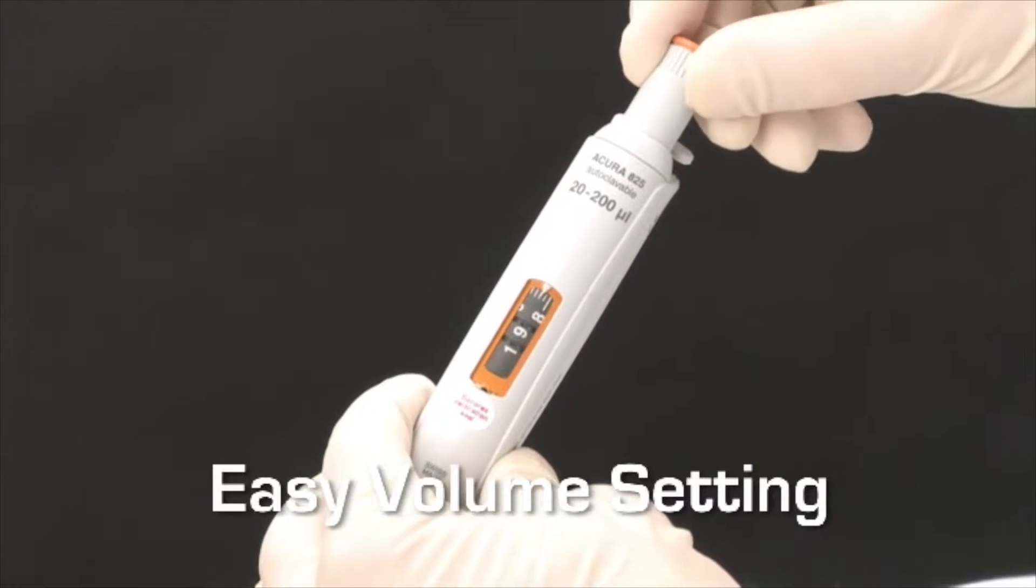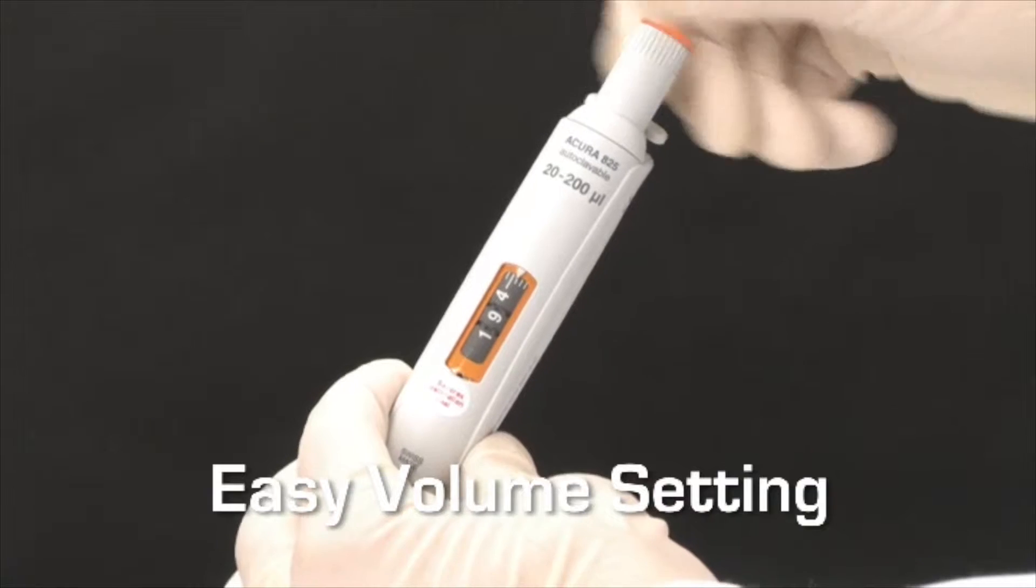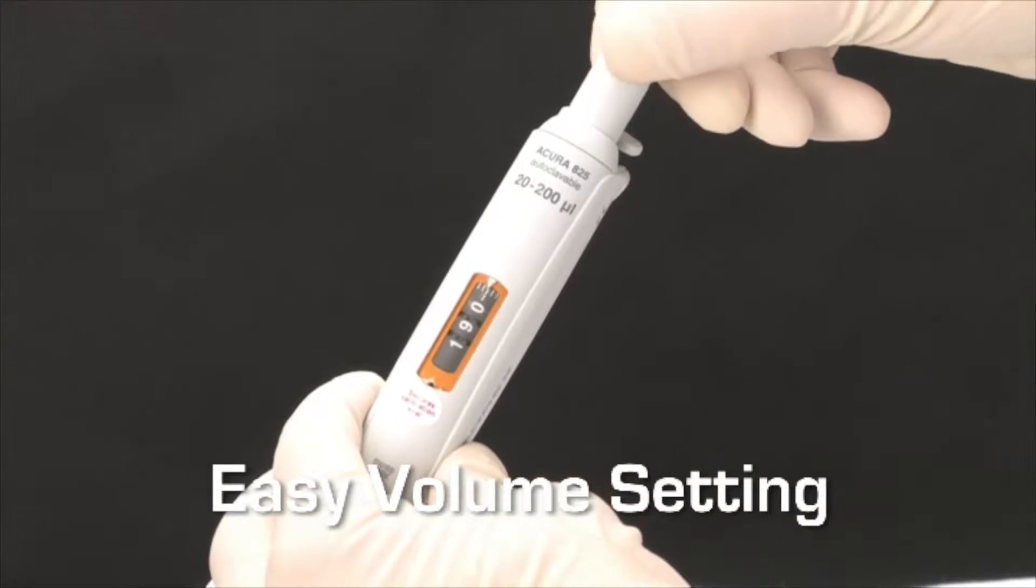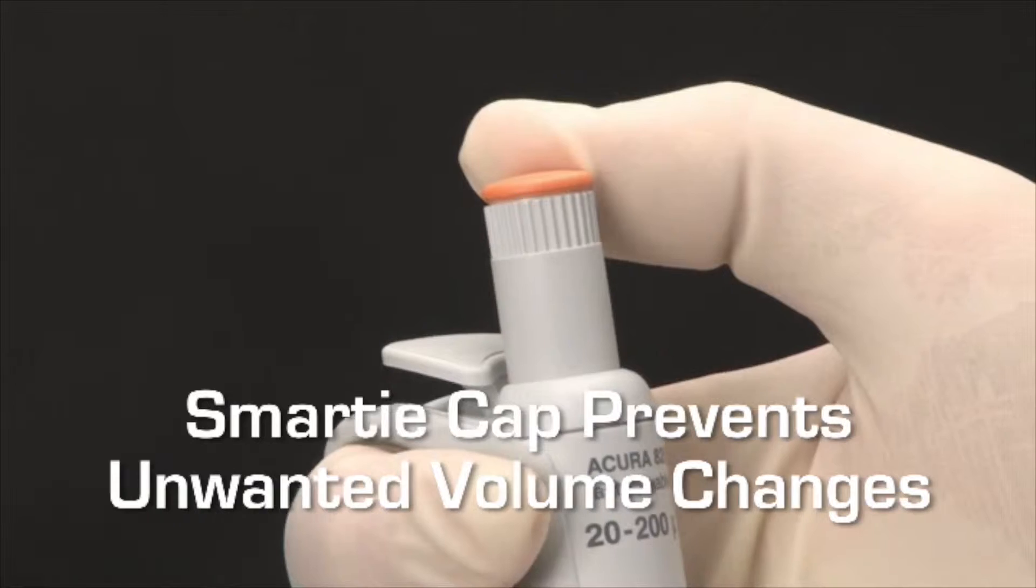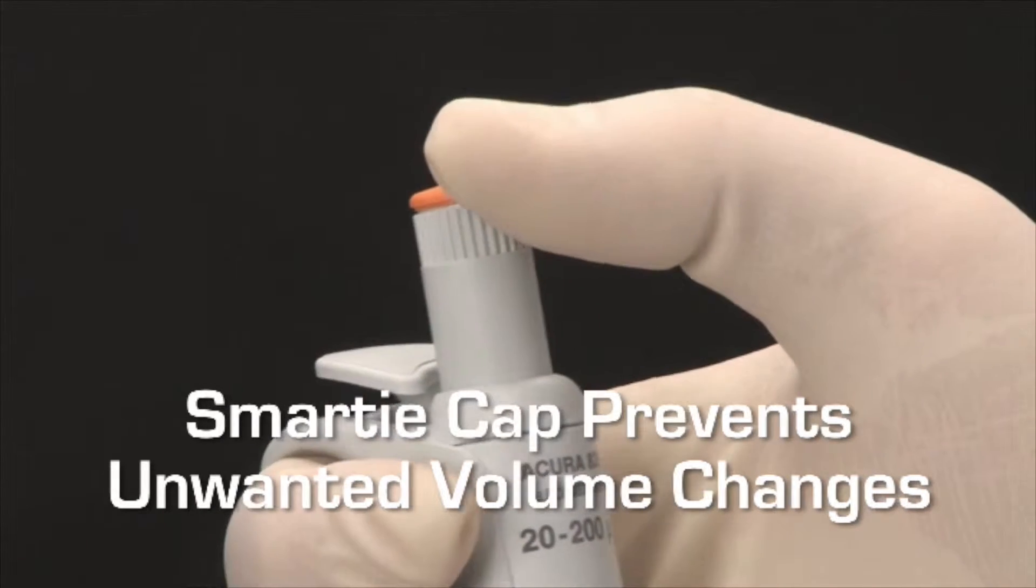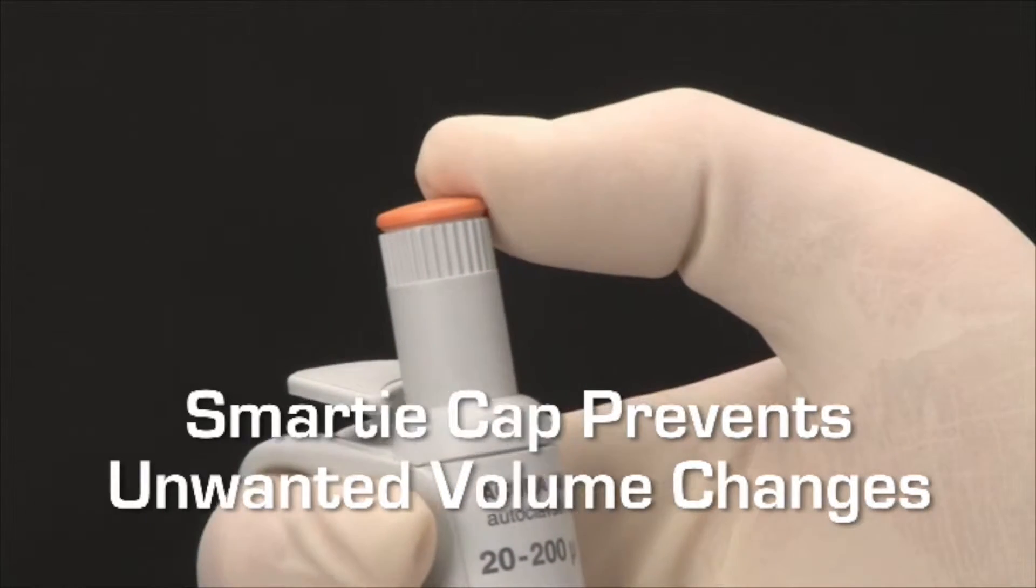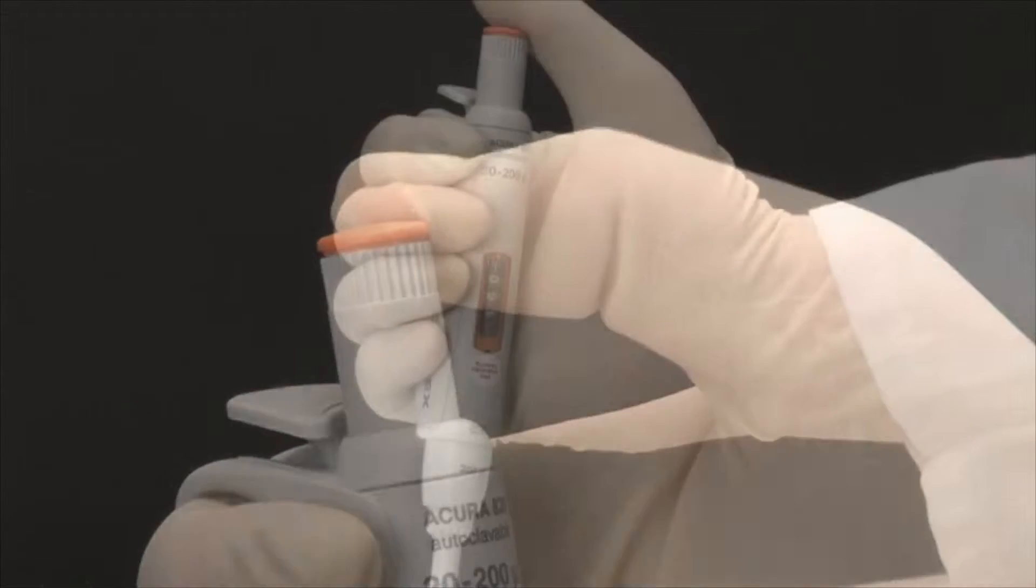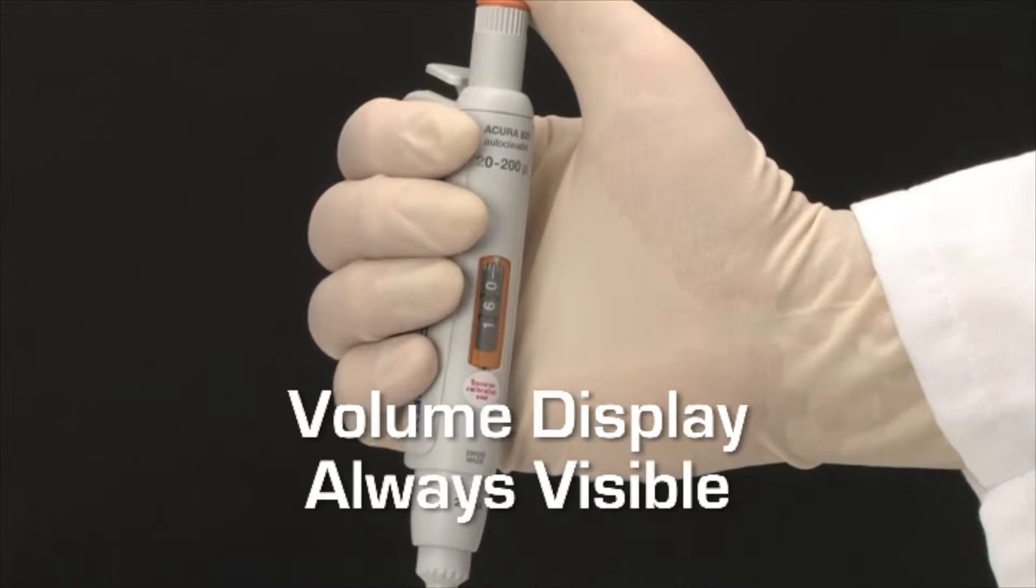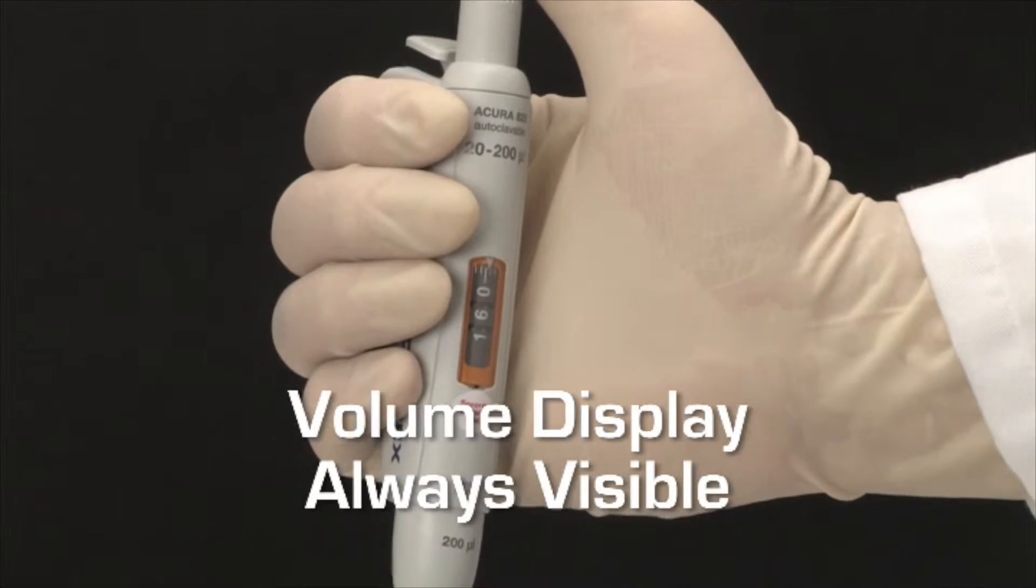Setting the exact volume to be dispensed with all Acura manual pipettes is simple and precise. Once selected, the free-rotating color-coded cap prevents any unwanted volume changes from occurring during use. For positive verification, the contrasted volume display is visible anytime.